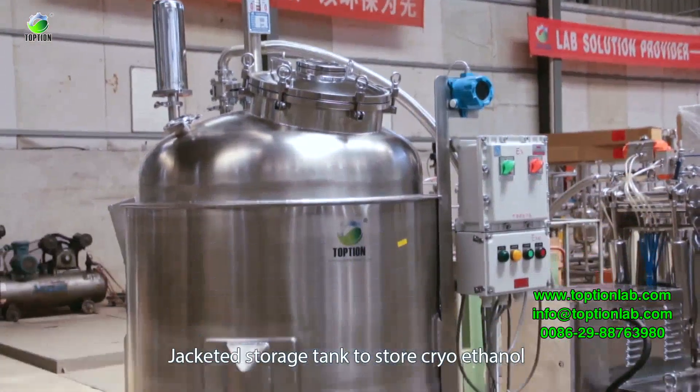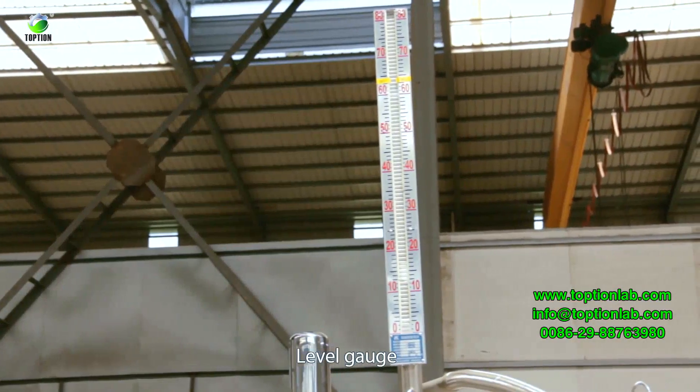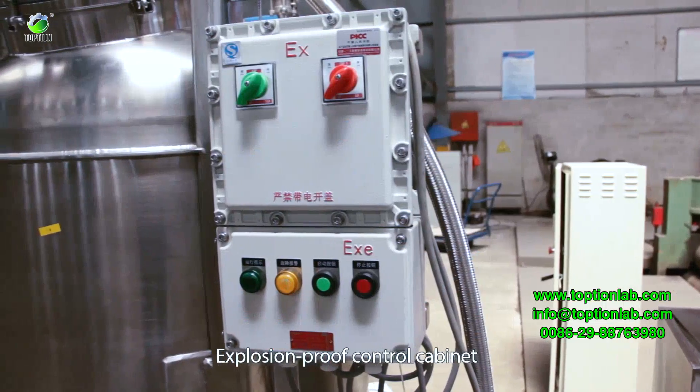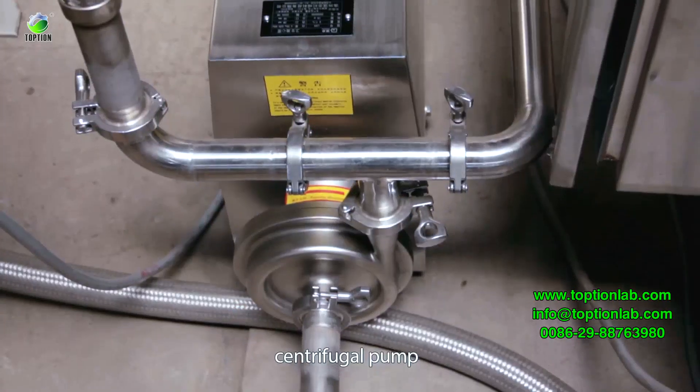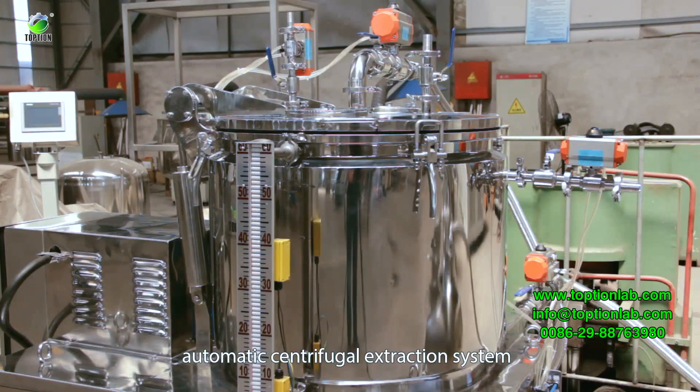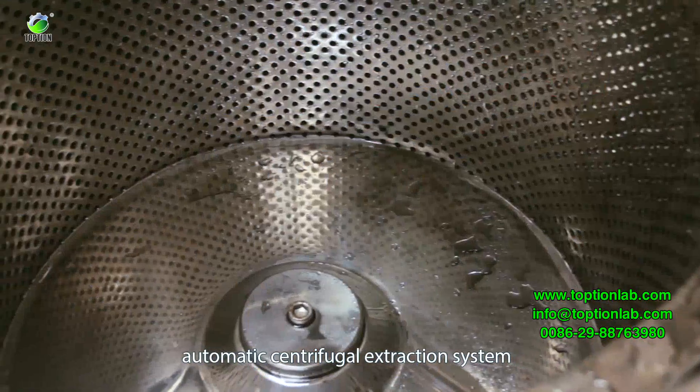A jacketed storage tank stores cryoethanol, equipped with a level gauge, thermometer, and PT100 temperature sensor. An explosion-proof control cabinet and centrifugal pump safely transfer alcohol into the integrated automatic centrifugal extraction system.